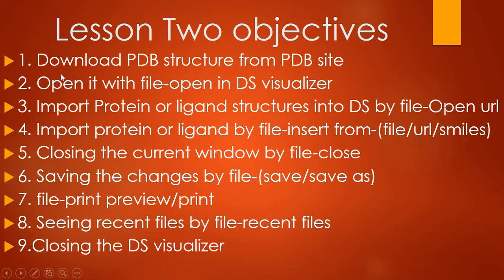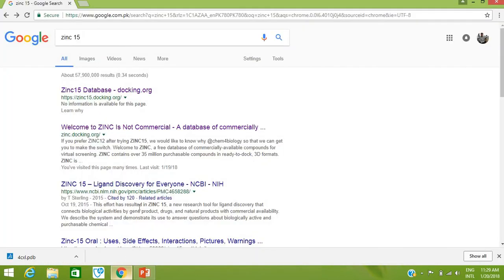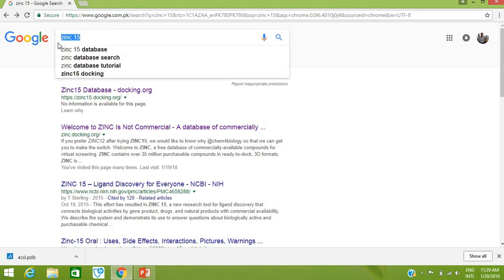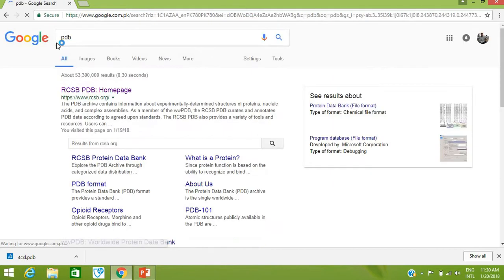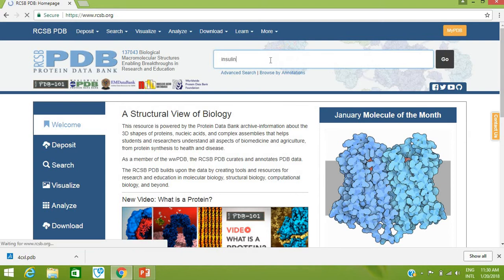The last objective is how to close or exit DS Visualizer. Now let's start and complete the first task: downloading the PDB structure from the PDB site. Open your Chrome browser or any other browser and search for PDB. Click on the RCSB PDB homepage and search for any protein, like insulin, which is a hormone.